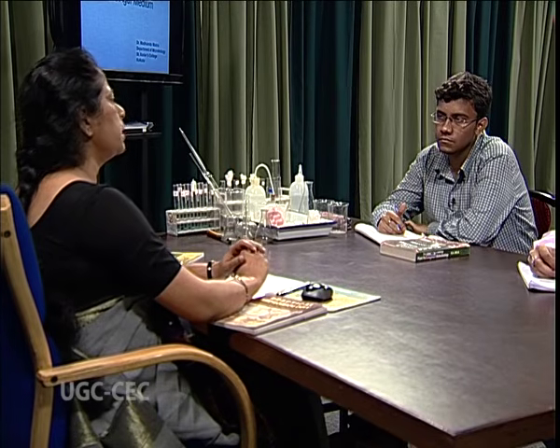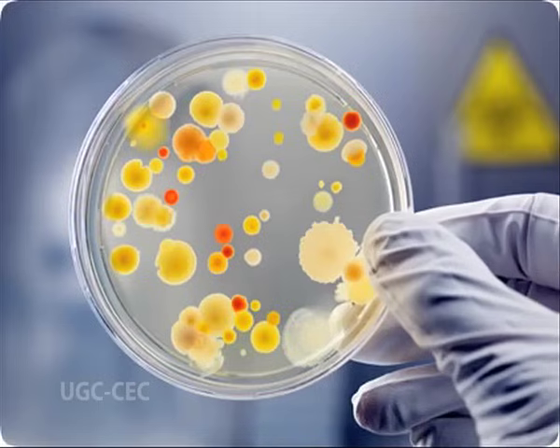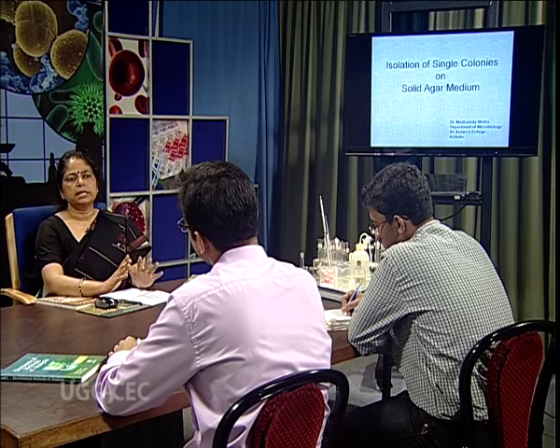Culture media, based on their consistency, is of two types. One is a liquid culture media, or it can be a solid culture media. Now, when it is a liquid culture media, we don't add any solidifying agent. But if any solidifying agent is added to a liquid culture media, then it is converted to a solid culture media.